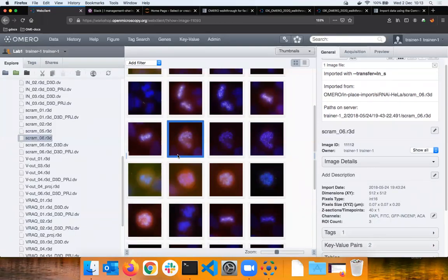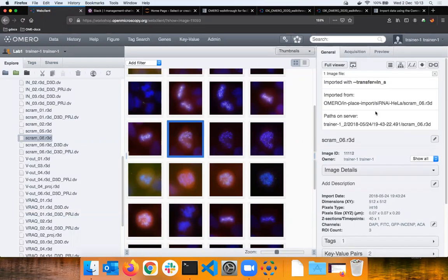You could have a cron job that runs through the entire system and checks whether the paths still match, and sends an alert. But if you know that some images have been changed, you already have the ability to fix those paths, and that is done via the API. You don't have to go directly into the database and enter the value manually. We can do all that via the API, and we'll publish some of the scripts that we have for our use.